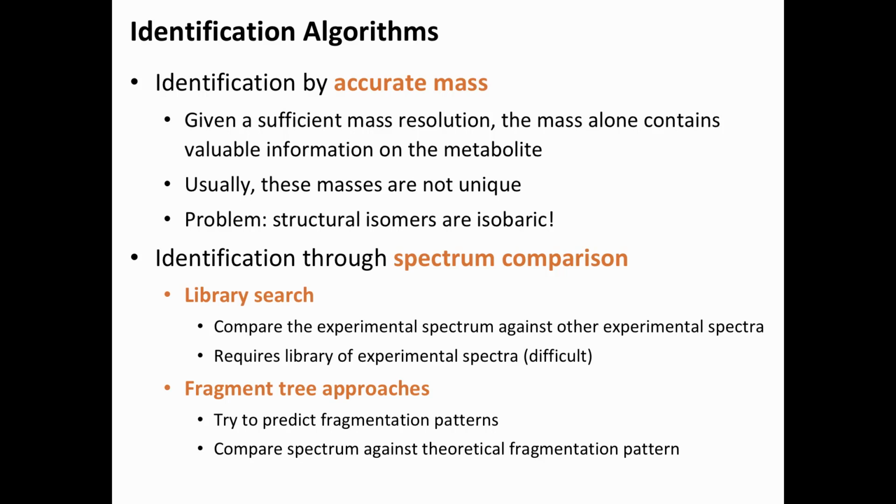Many labs have built up their own libraries in-house. They just buy 500 compounds and run them through because those are the ones that they're interested in. They think that's a highly valuable resource, so they don't share it. So everyone has 500. And that's, of course, very, very inefficient. And, of course, they're not as valuable as people think, because everyone has them, so it can't be that great. But since nobody's sharing the data, everyone has 500 different ones. The overlap's probably going to 400, because everyone does amino acids, everyone does a couple of sugars.